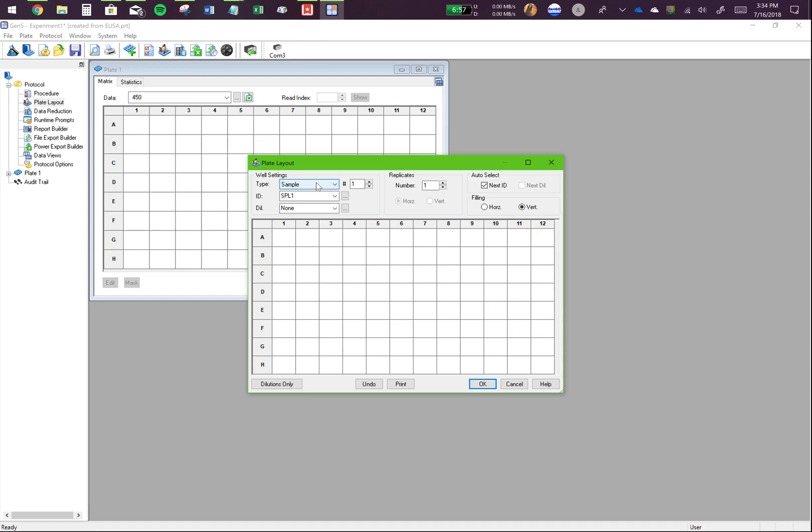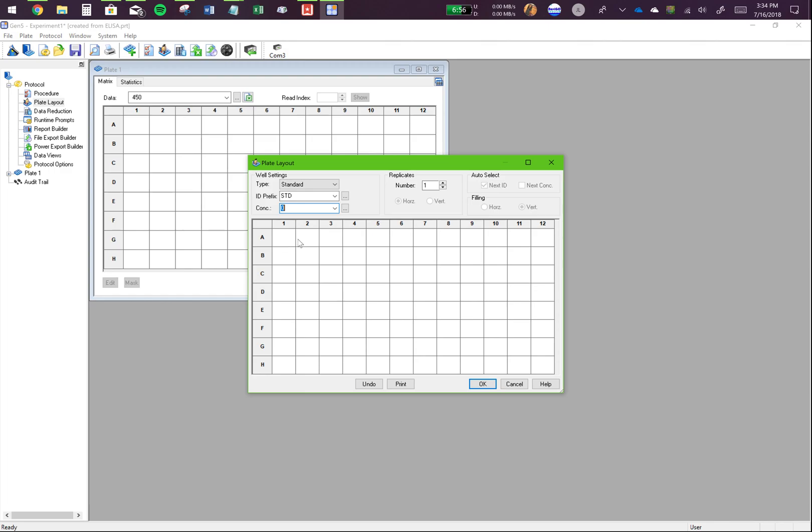Next, I want to click on standard. Remember, a standard is a set of points that, when connected, make a curve that can be written mathematically. So, this standard curve will be used to find out values for unknown samples whose concentrations are not known.